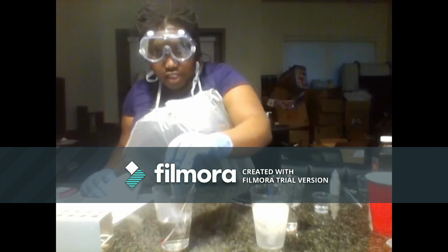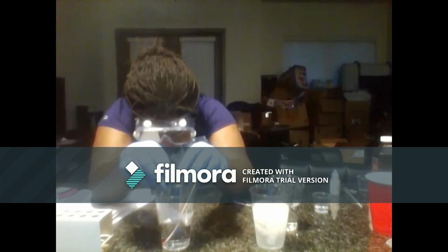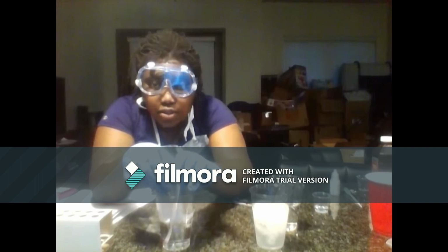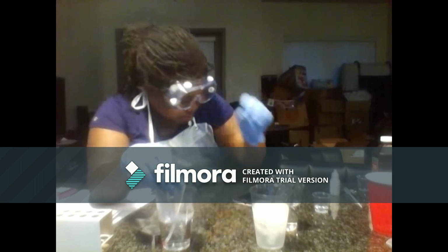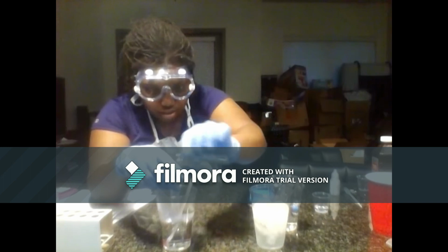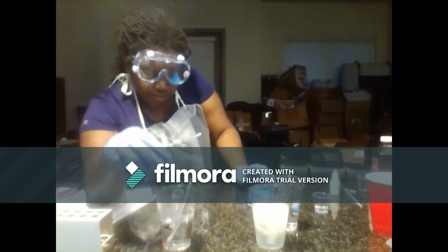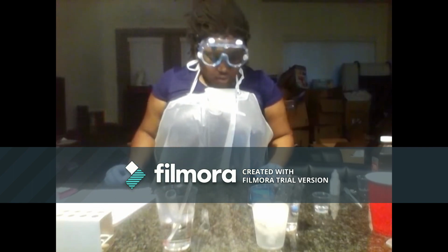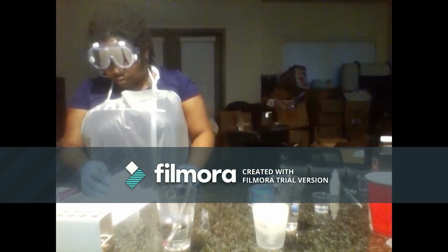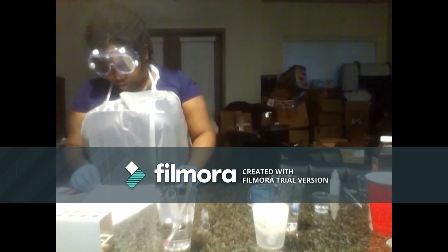And so these have been sitting in here. My test tubes of my potassium iodide solution and my hydrogen peroxide have been sitting in here for 5 minutes. And now I'm going to begin this reaction and start my timer. Let me get my timer ready. Okay. Well, that's already done. So, alright. I am going to record the rest of my data and prepare for the next activity with the copper chloride solution, the catalyst.